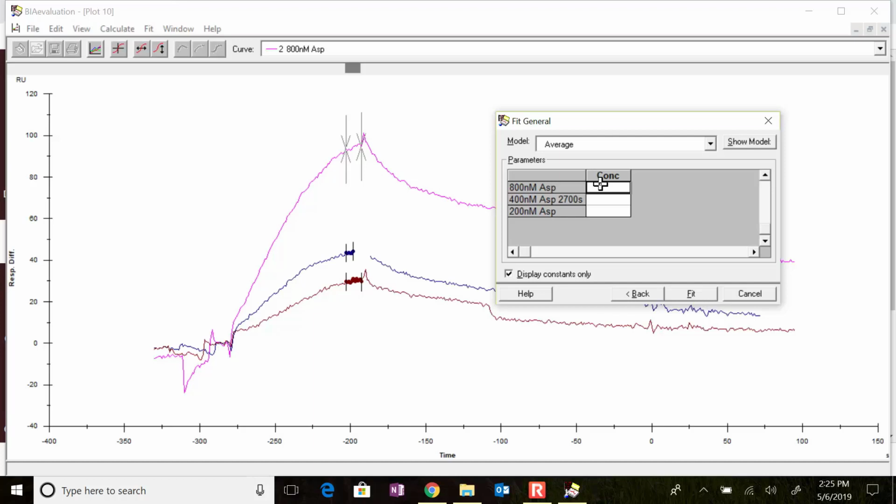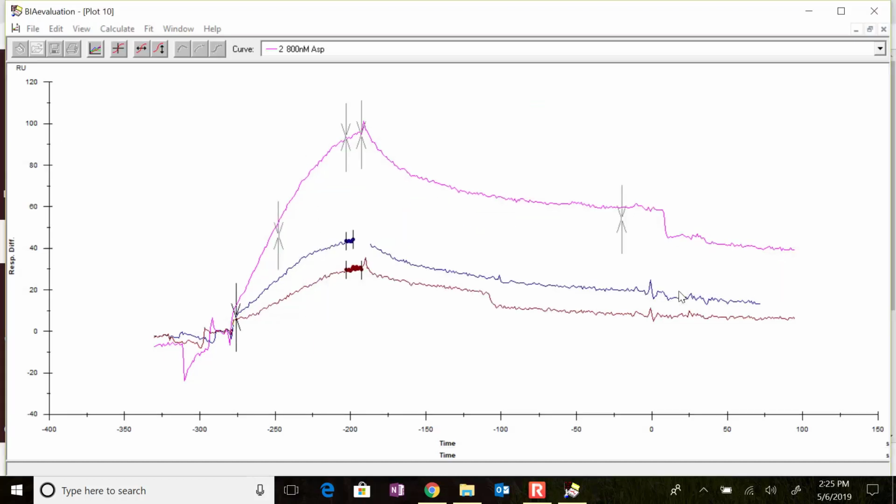This is why you labeled all those previous ones before, because they're each labeled. You can just put in 800N, 400N, and 200N. You will be putting in very similar numbers to this. N basically just means 10 to the minus 9th. It's telling you as a calculator, multiply that value times 10 to the minus 9th. It's a lot easier than typing in that little caret thing and trying to tell the computer how to do exponentials. Okay, so we've entered in all these.